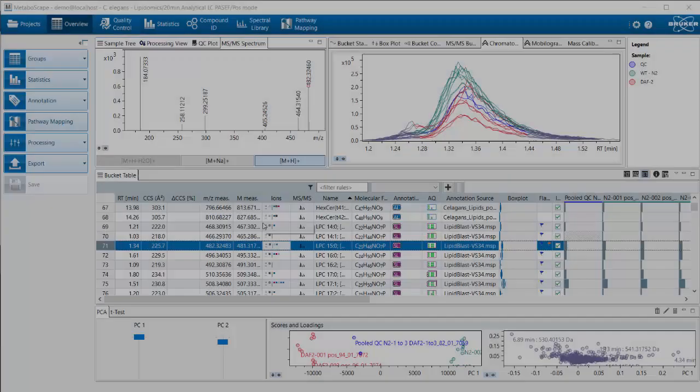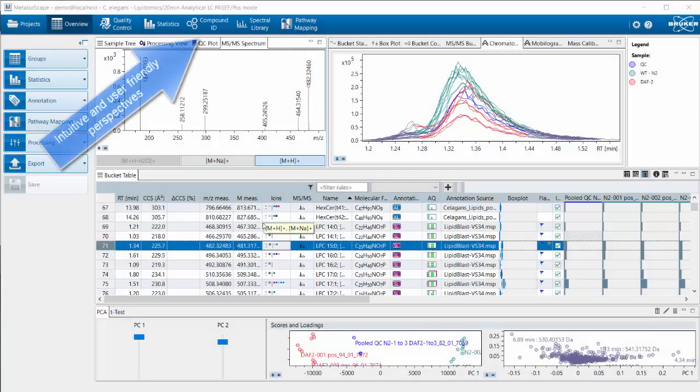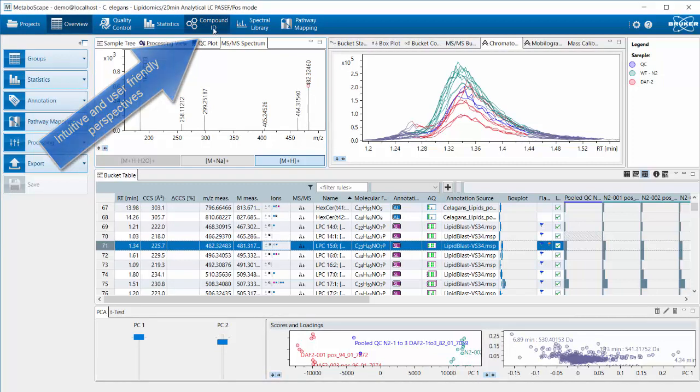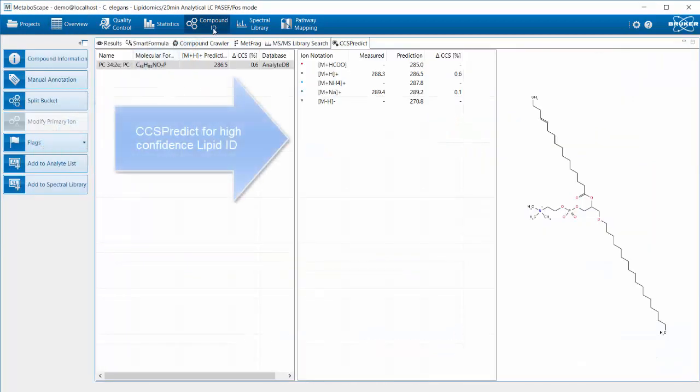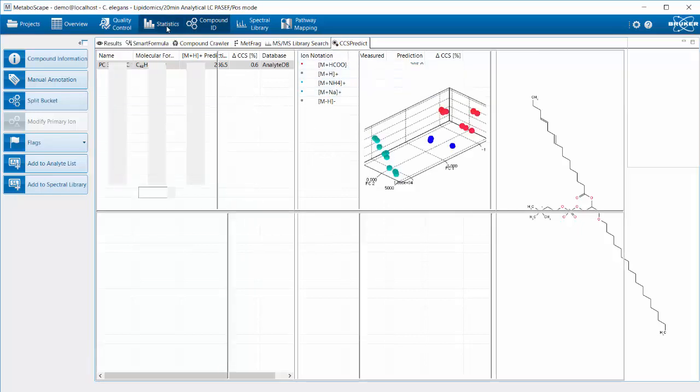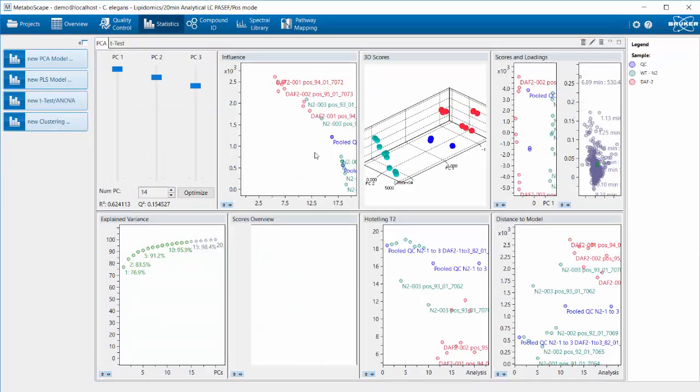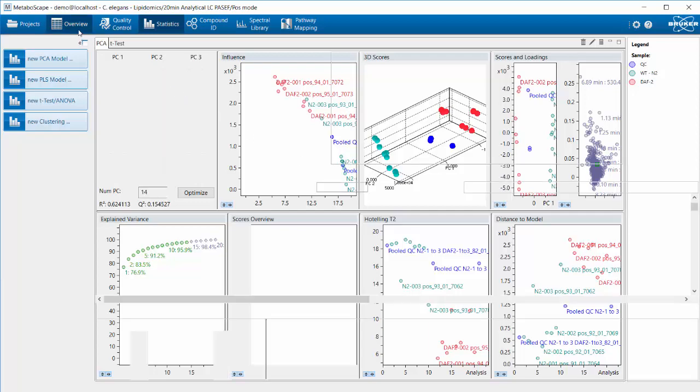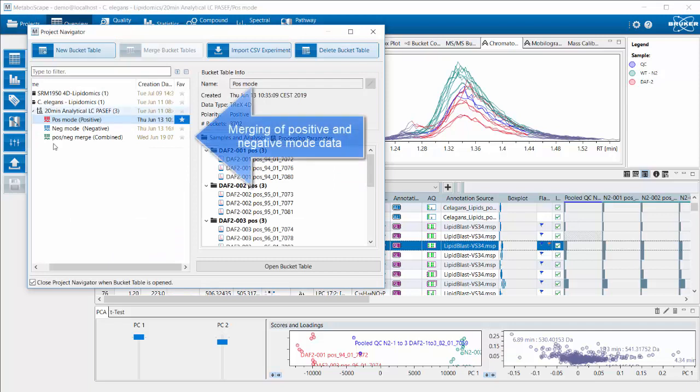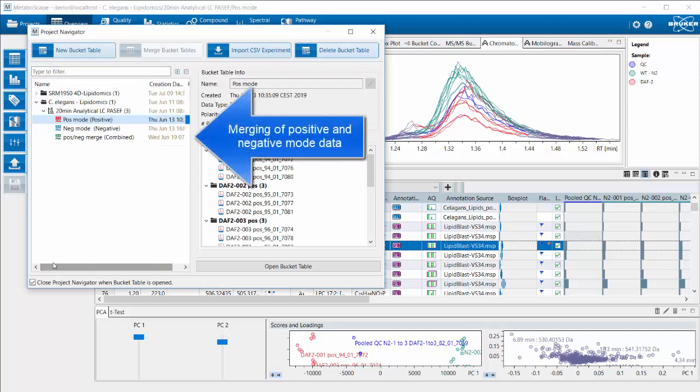Let's have a look at the software and the user interface. You see here at the top we have different perspectives that we can select, including the Compound ID perspective featuring CCS Predict for high-confidence lipid ID. Different statistical plots are supported, and in the overview perspective, a centerpiece with the bucket table.